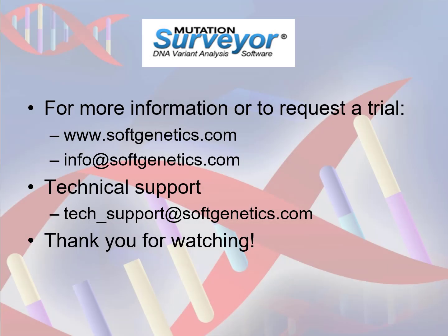This concludes the webinar on utilizing the variation tracks with external annotation in Mutation Surveyor projects.